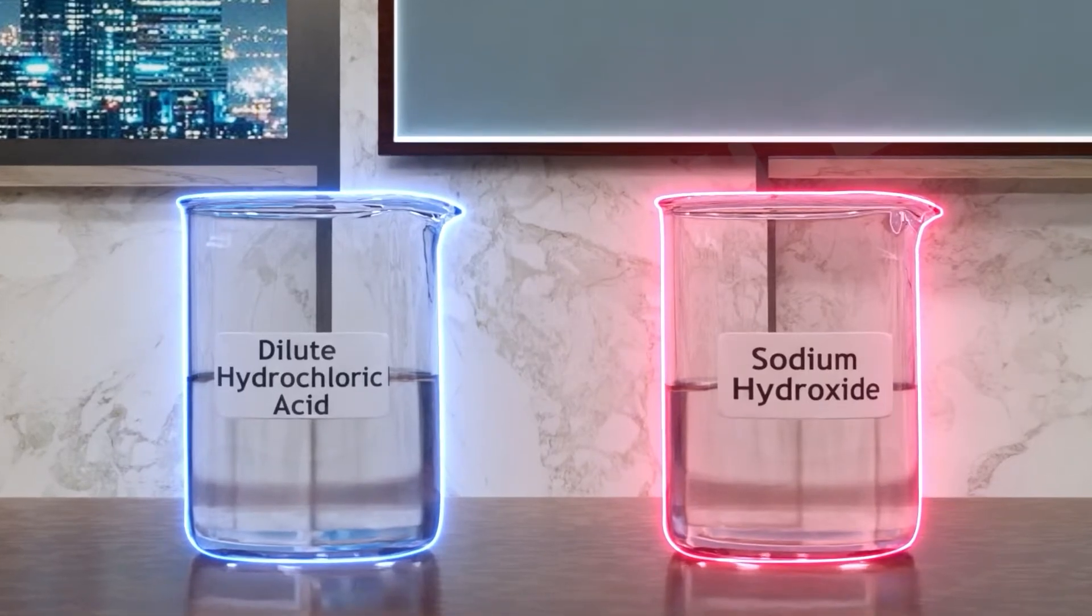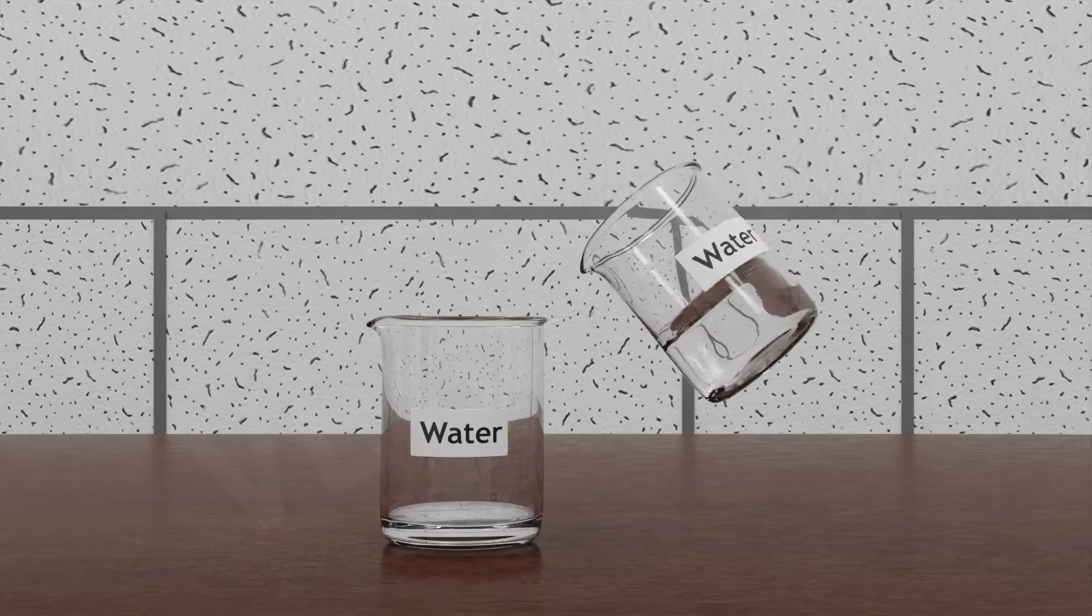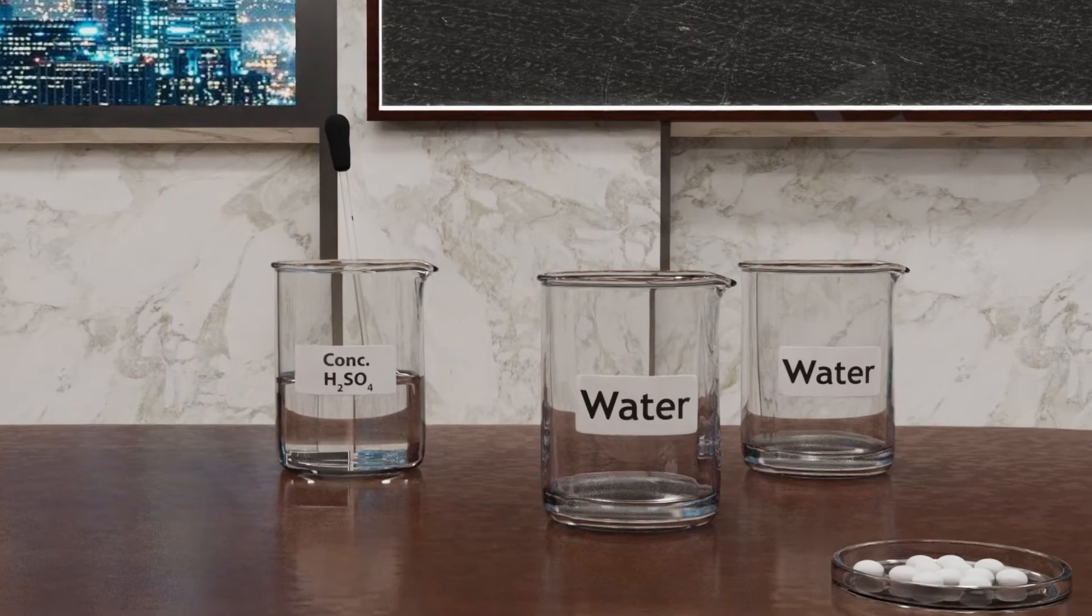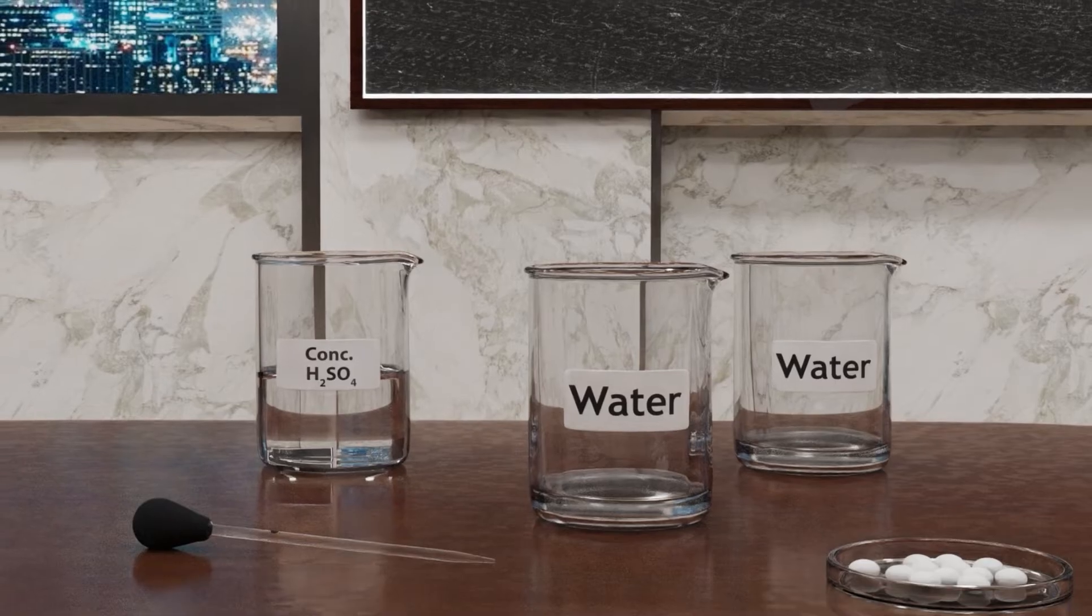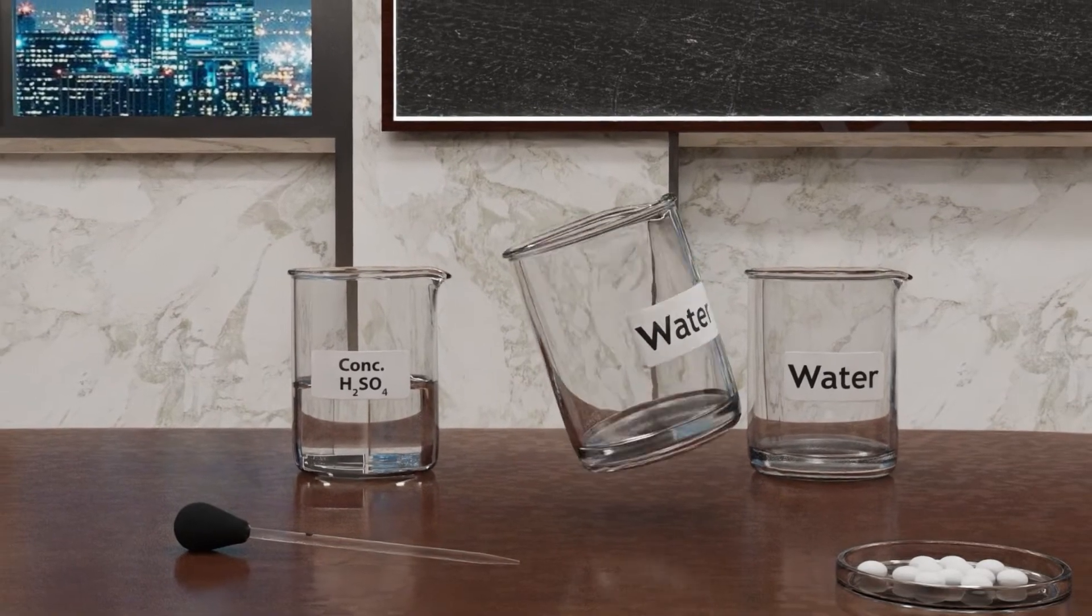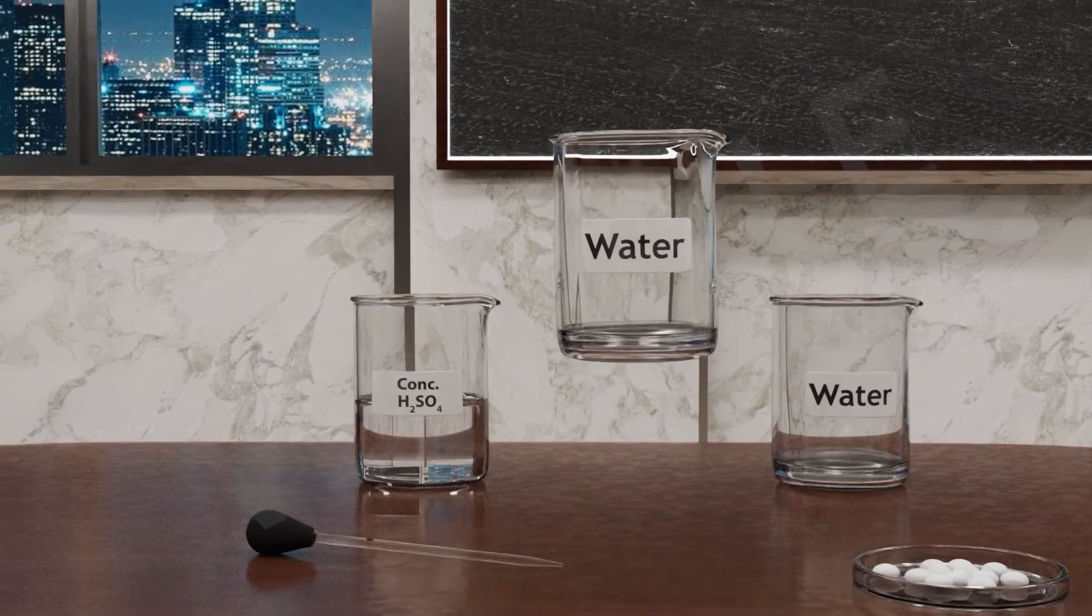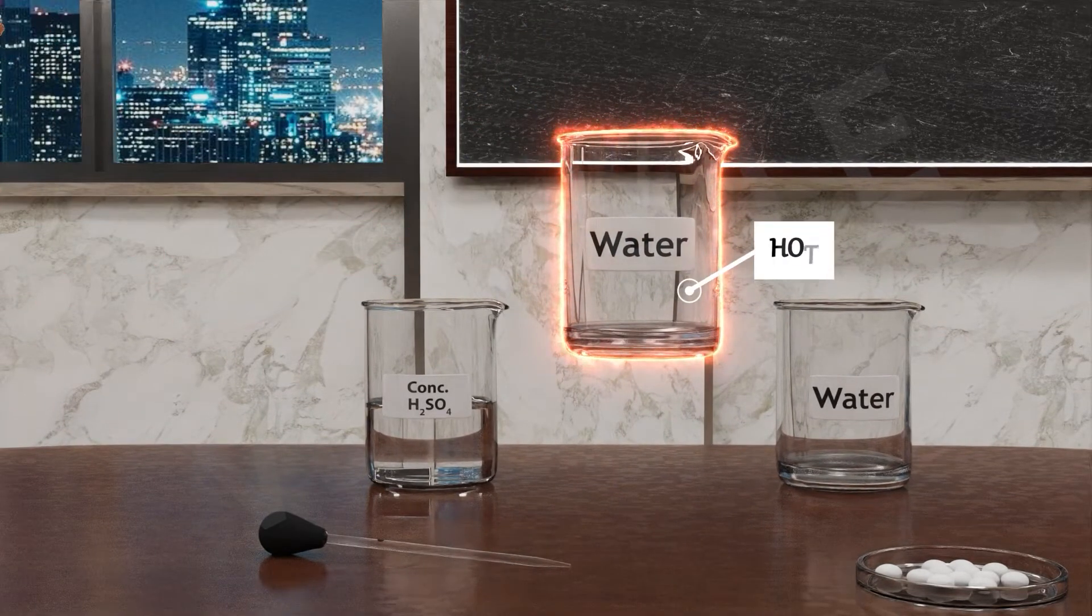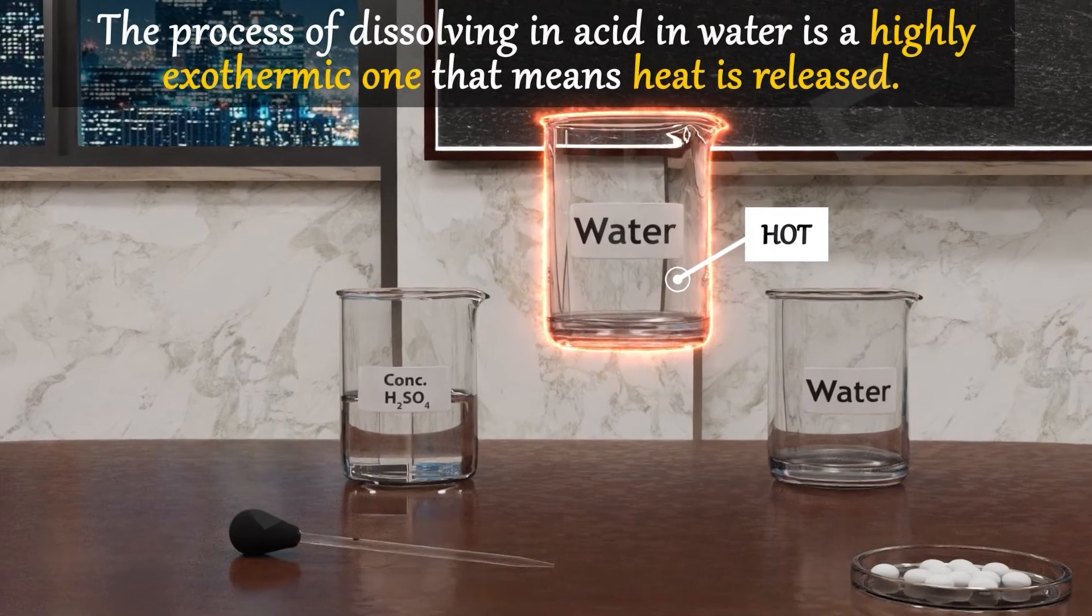Take 10ml water in a beaker, add a few drops of concentrated H2SO4 in it and swirl the beaker slowly. Now touch the base of beaker. Oops, it's too hot!